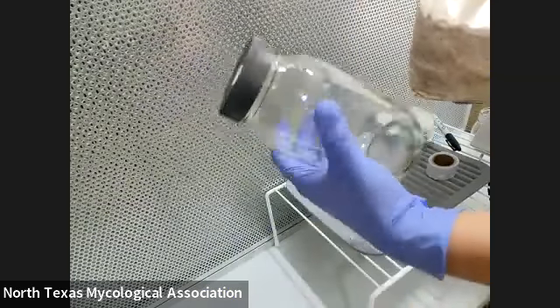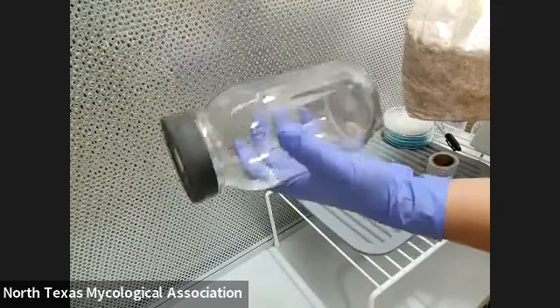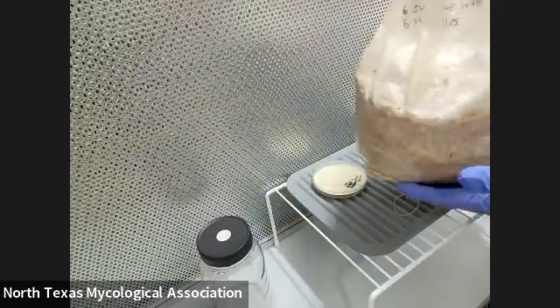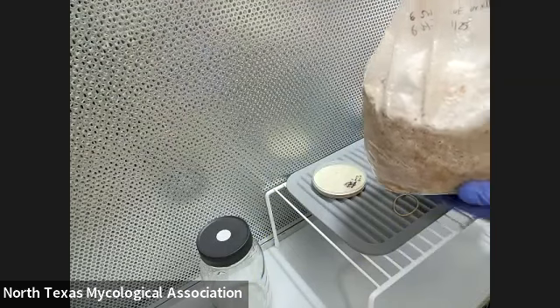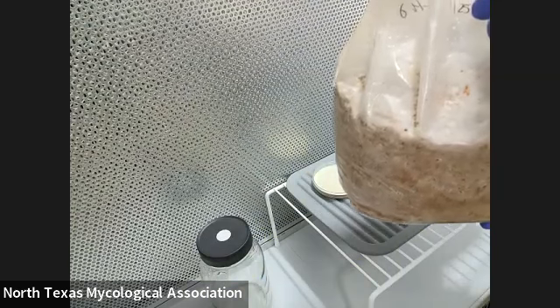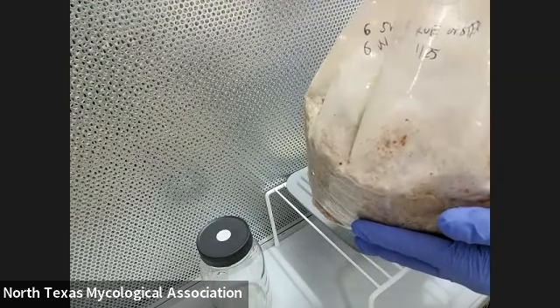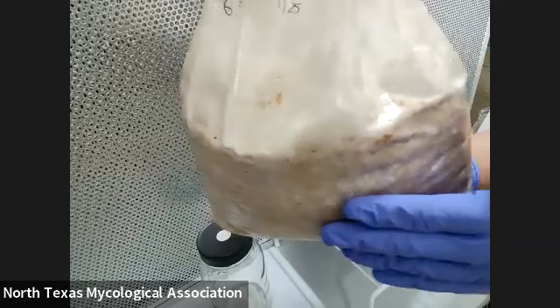After the grain is fully colonized, we just add the fully colonized grain to a bag of sawdust substrate — or whatever you want, but mostly they use sawdust. And then you just let it colonize. This was inoculated on the 25th, so it's about seven days — probably a little bit over a week. You can see how the mycelium took over the whole block.